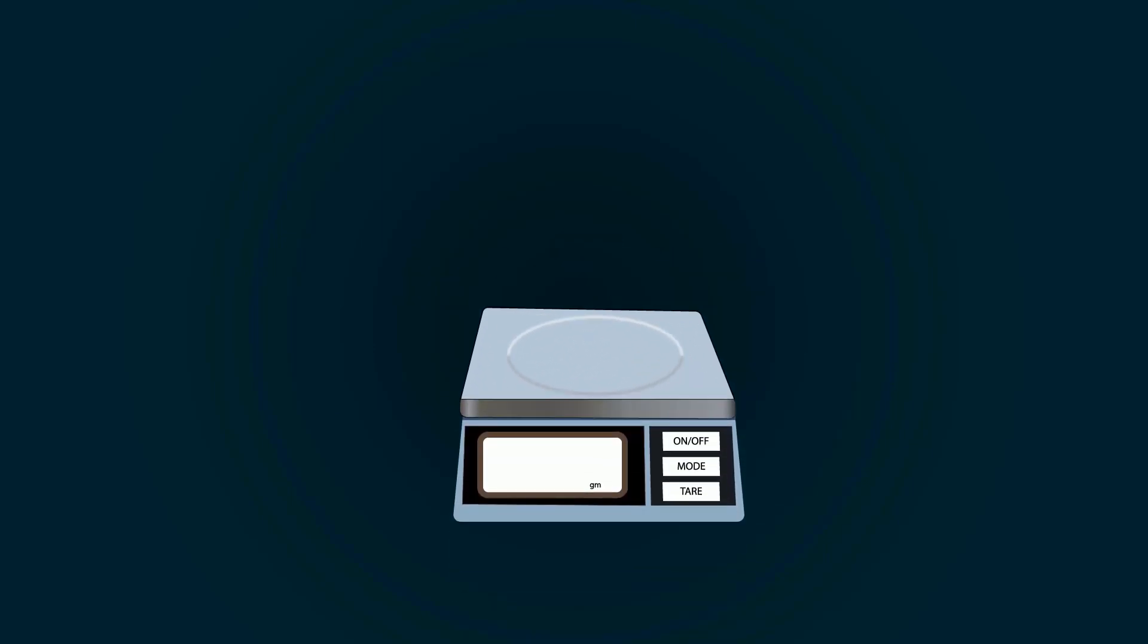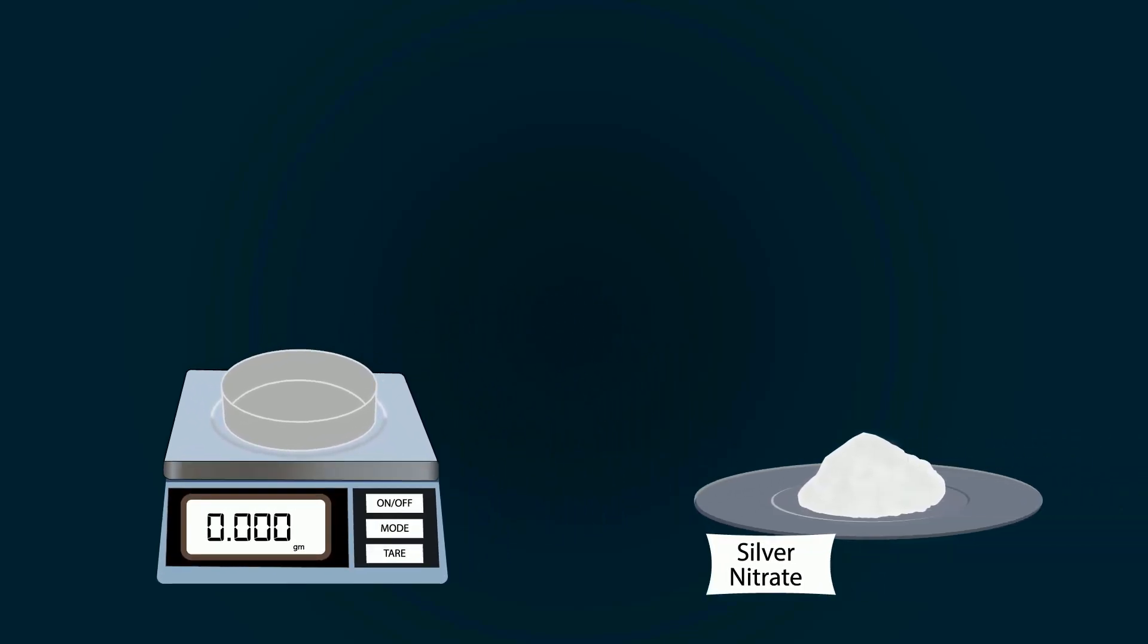First of all, take a weight balance and put a petri dish on it. Now tare it before adding silver nitrate. Add silver nitrate into the petri dish with the help of a spatula.